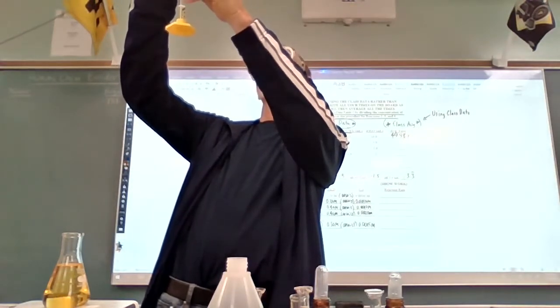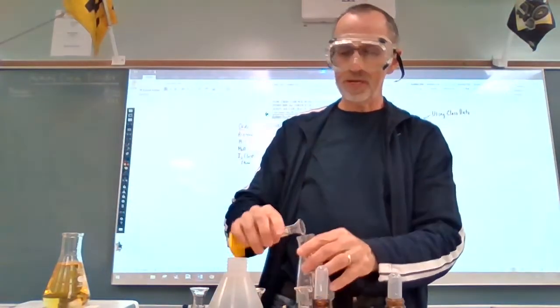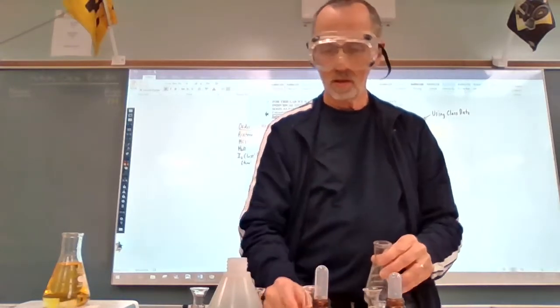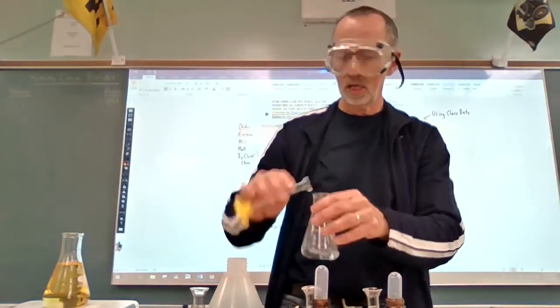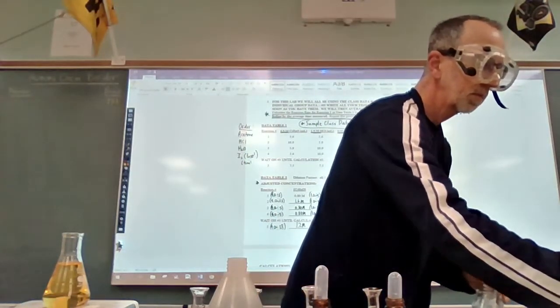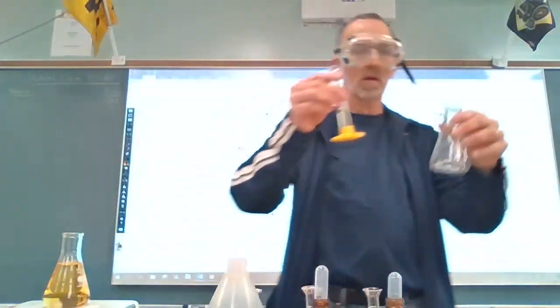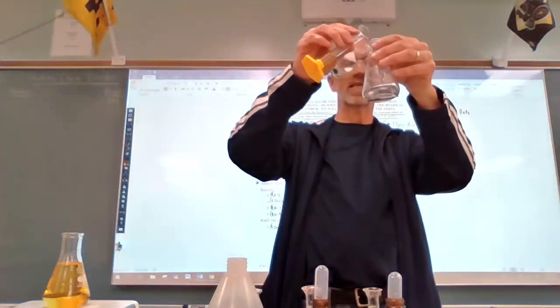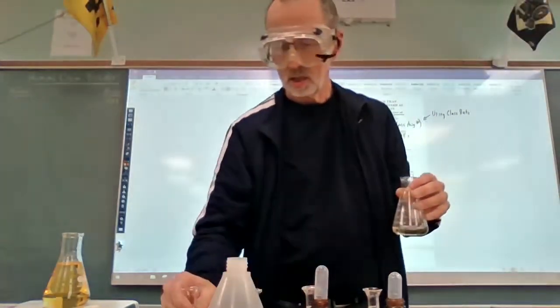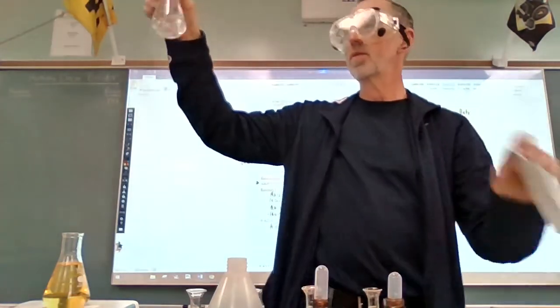Okay. Again, I'm going to pour the first 3 in the order we discussed. Get the phone ready here. There we go. Clear. All right. Here we go. Going to add the iodine. Start the clock. Again, mine's a little delayed. Boom. And swirl the flask.